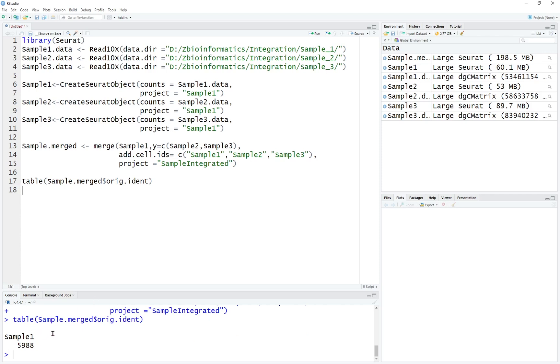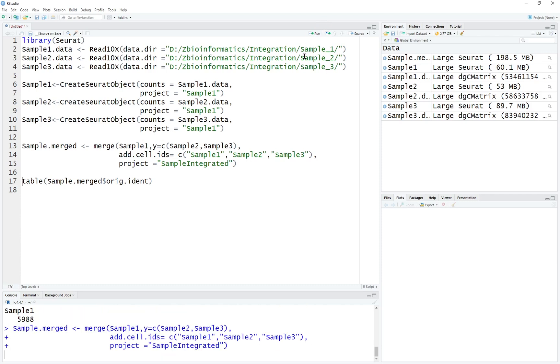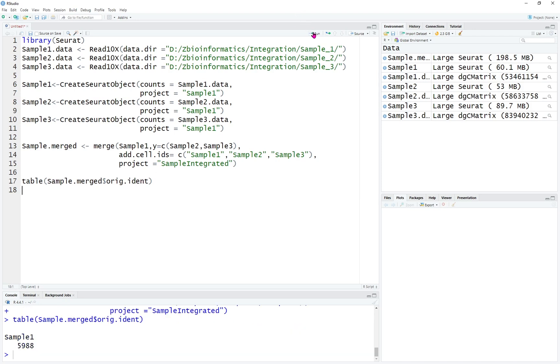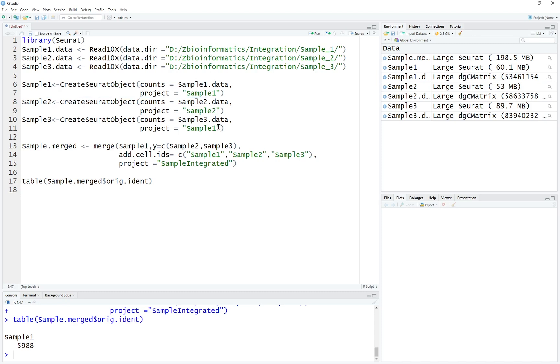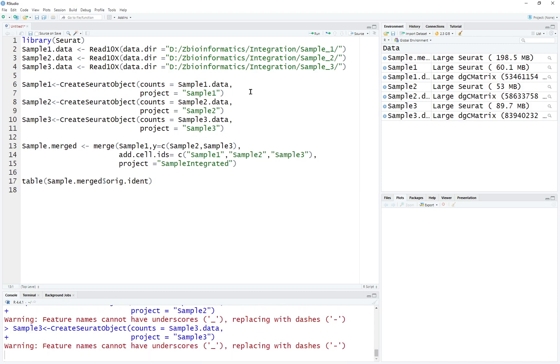After running this, you're going to see the sample merged table. We haven't run this command yet — after running it, we'll see the merged original identity showing sample 1, 2, and 3. There's one typo — we should name the project as sample 1, 2, and 3 for each respective object. Otherwise, everything will be named as sample 1. We're going to rerun those three lines of code.